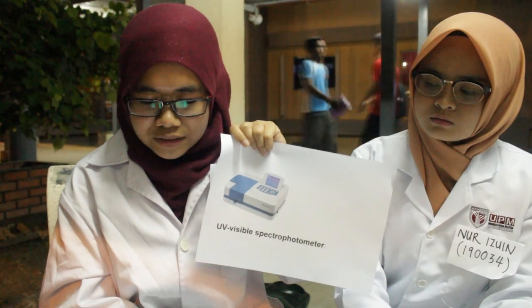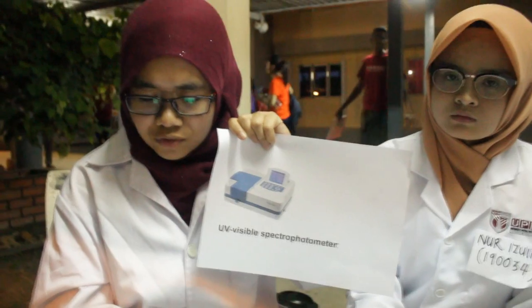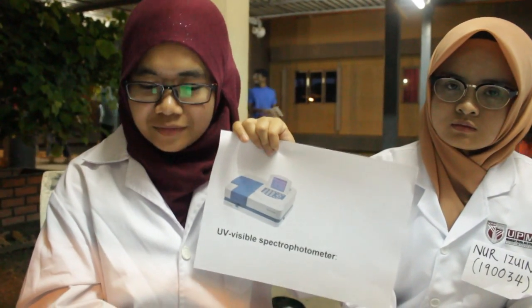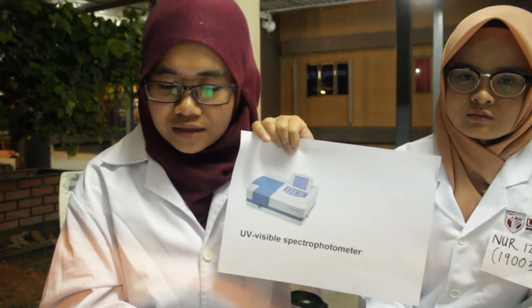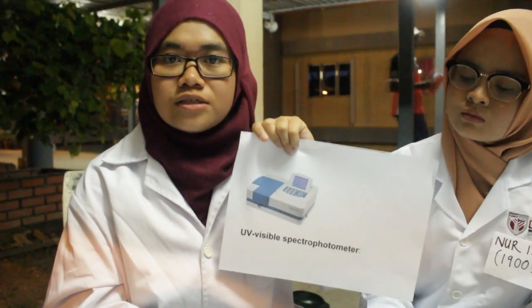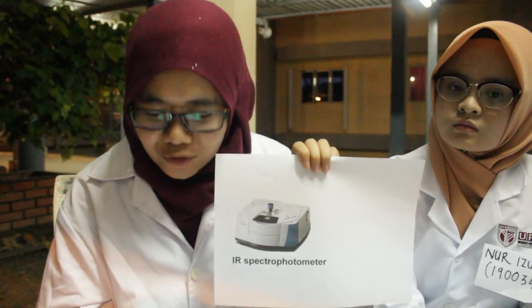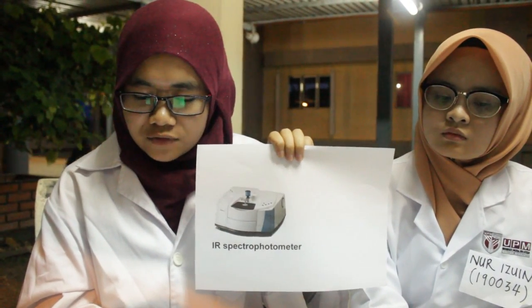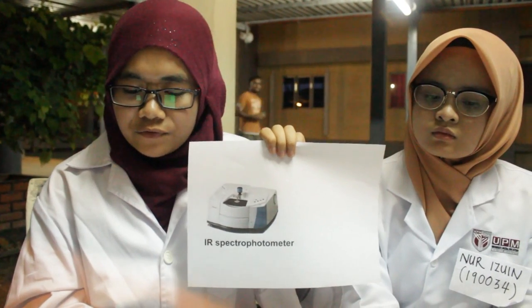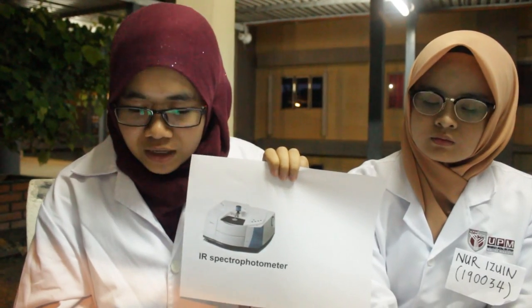It uses light over the ultraviolet range, which is between 180 and 400 nanometer, and the visible range from 400 to 700 nanometer of the electromagnetic radiation spectrum. Okay, this next is the IR spectrophotometer, which is infrared spectrophotometer. It uses light over the infrared range, which is from 700 until 15,000 nanometer of the electromagnetic radiation spectrum.